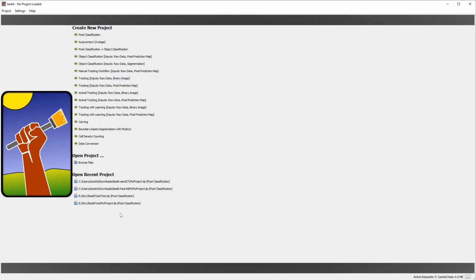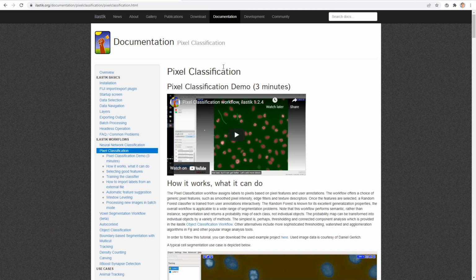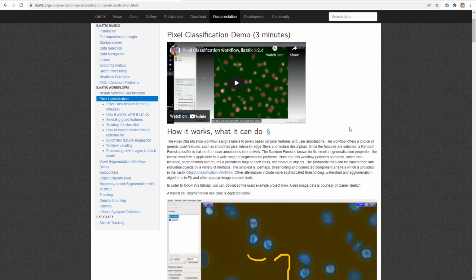Now, before we go to the step-by-step tutorial for Ilastik, I just wanted to go through the documentation here, which is online, and I'll provide the link to this documentation in the workshop website. I highly recommend going through this 3-minute video that shows you a quick example of how to use Ilastik. I just want to go through it briefly to give you an overview of how Ilastik works.